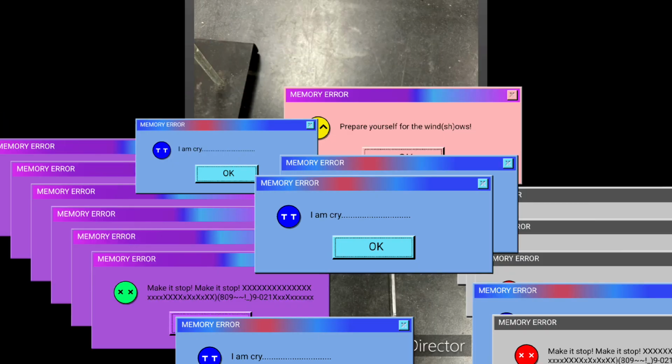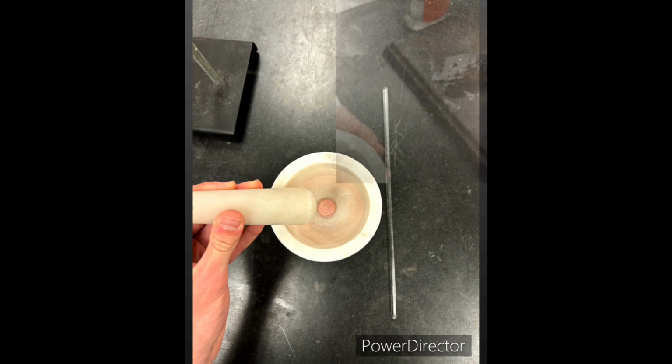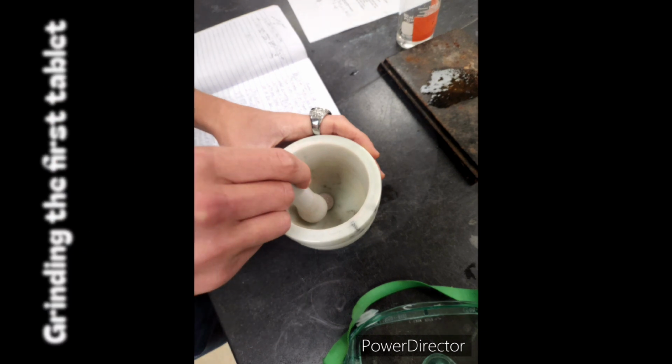We start the antacid lab with a mortar and pestle, a stirring rod, a burette, and 1 singular antacid tablet. We then ground up the antacid tablet in the mortar and pestle until it was left in a fine powder.